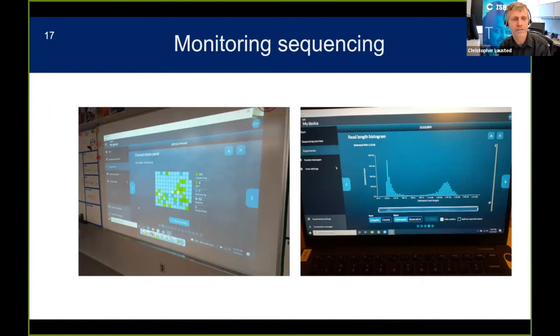Okay, sure. So yeah, it was quite a eureka moment when the students injected the DNA libraries onto the Nanopore sequencer, and data started appearing. As Danielle mentioned, we didn't sequence DNA randomly. We amplified a gene, the 16S ribosomal RNA gene. This is about the most conserved thing in the whole universe. All life on Earth has this, so it's really good for classifying and counting many different organisms.